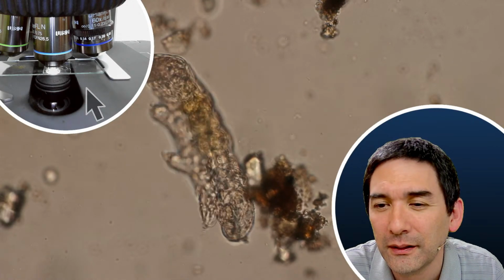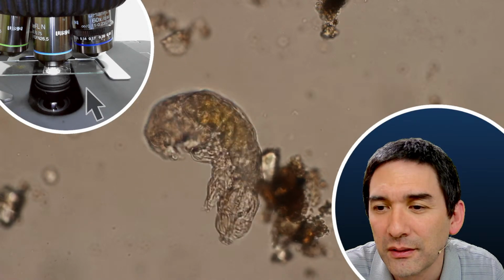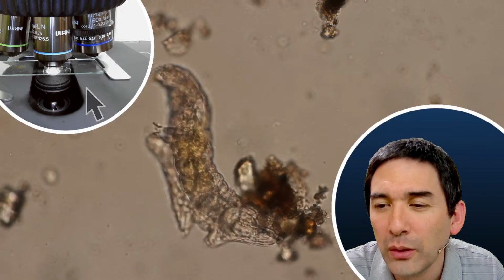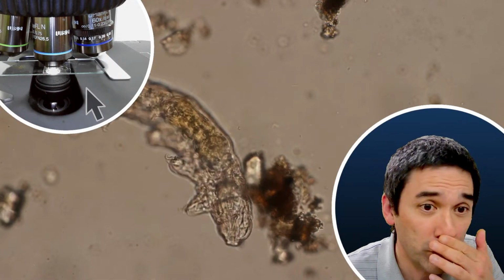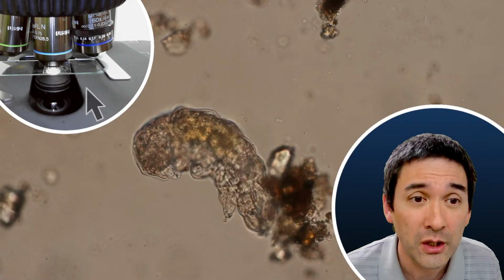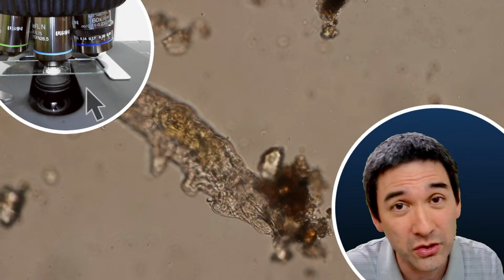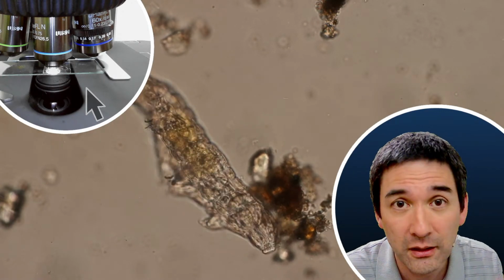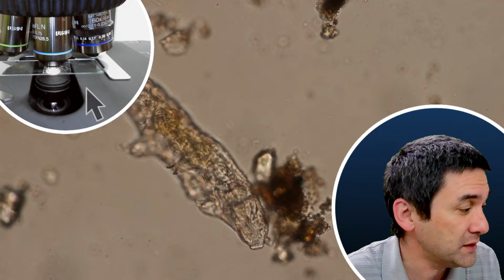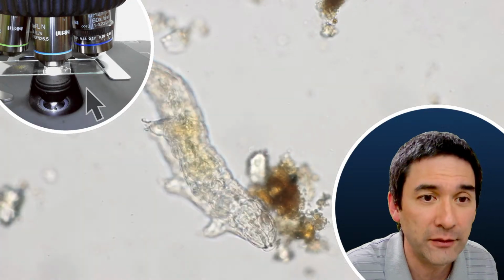Tardigrades even live in oceans, and underground streams. Do you have phase contrast? Yes, I do have a 40 times phase contrast. So if you want to, you can look at it. It doesn't look that great. Phase contrast really looks very good for very thin objects. But because you're asking, I'm just going to switch over to phase contrast, and this one is now bright field.